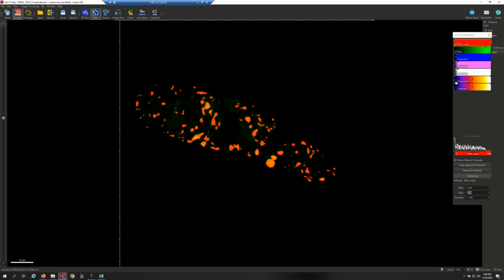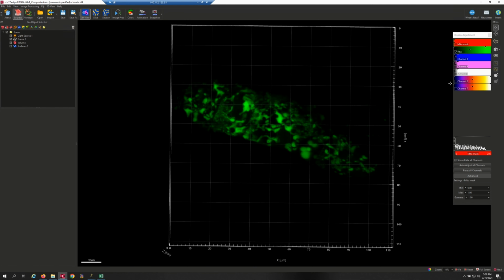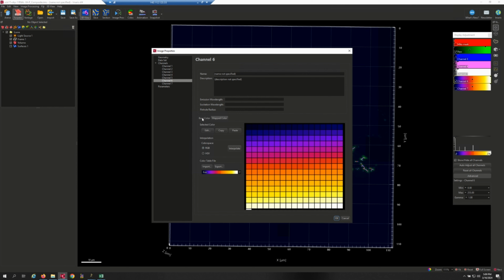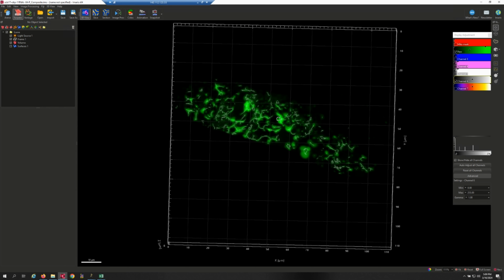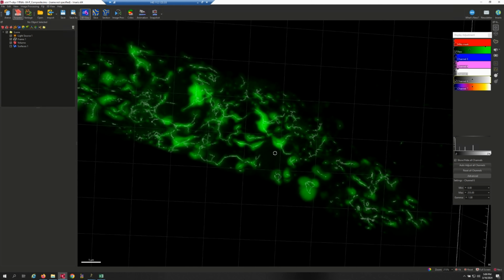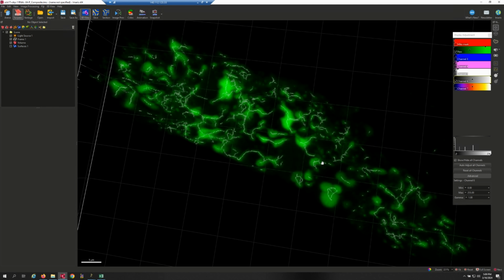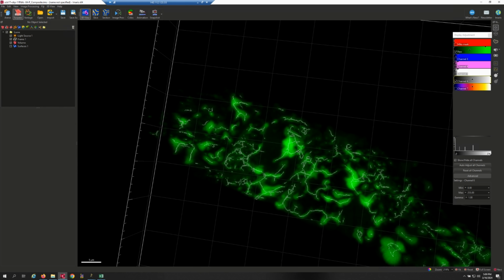Next, we're taking a look at the 6th channel. At this point, I'll turn off the mask first, then leave the raw file enabled, then switch back to the 3D view. At that moment, it'll turn on the 6th channel. And what about this image file? Because I've already processed it, when it first loads, it should appear completely white. Alright, so this white appearance, you can switch it back to the 3D view. Then check whether the skeleton created using the mask actually matches what you had in mind. At least, I believe a skeleton like this fits my expectations.